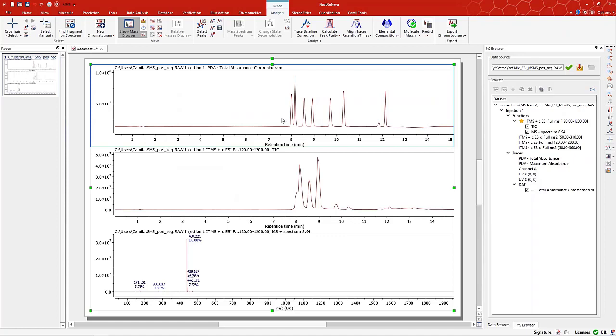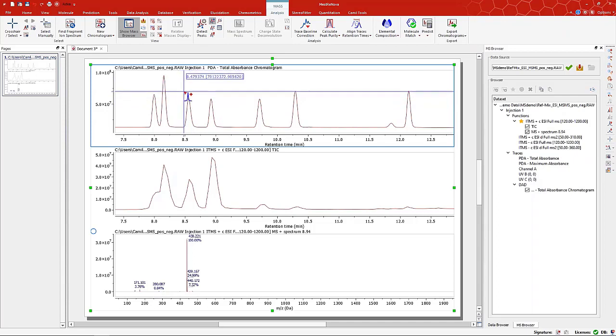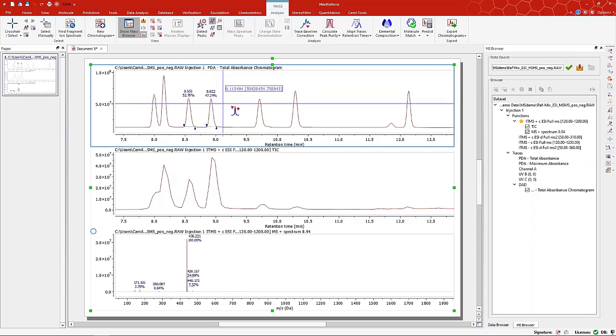Sorry, I keep zooming in and out because I just want to see what it looks like overall. So I'm going to zoom back in. And let's say I want to do a manual integration this time. So the ribbon here, I'll go through a couple of the items, but right now let's focus on detecting peaks. If you click on this add peak symbol, right, and you get this sort of command, now I could just pick and drag peaks like that for integration.